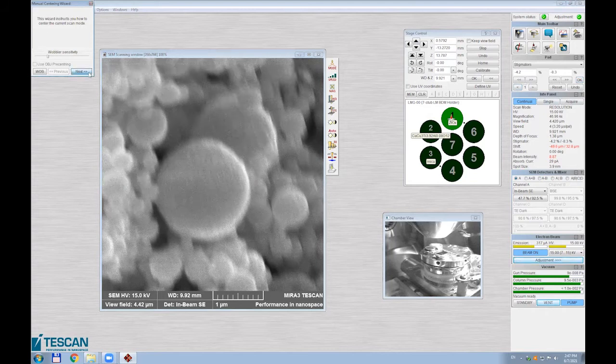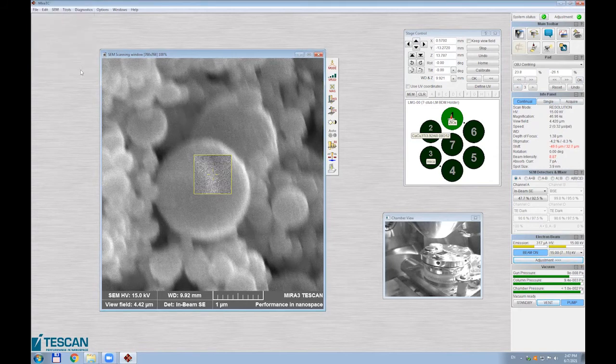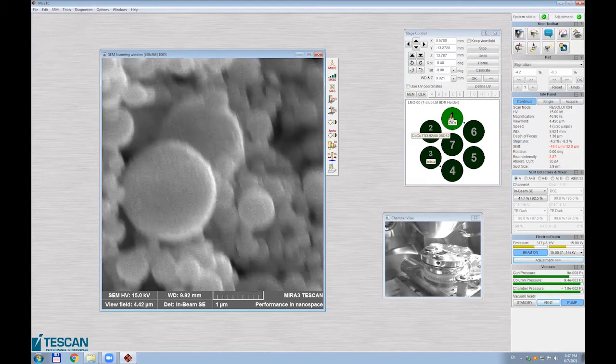I will do just a simple adjustment. And we'll go even closer.